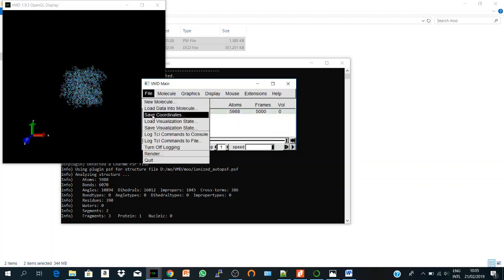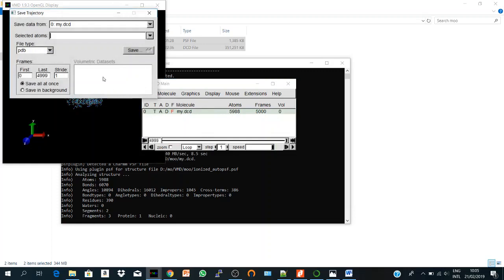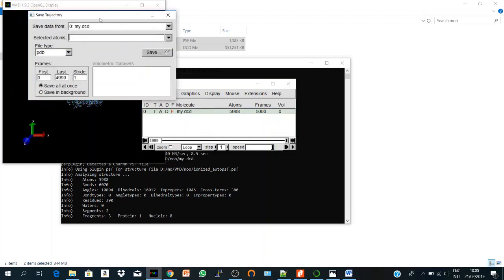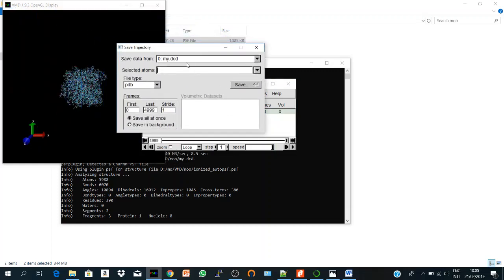And I select and I go to File, Save Coordinates, and here I save the data from my DCD. And here the selected atoms could be all if you want everything, or you could choose protein only if you don't want the solvent. For example, I want only the protein.